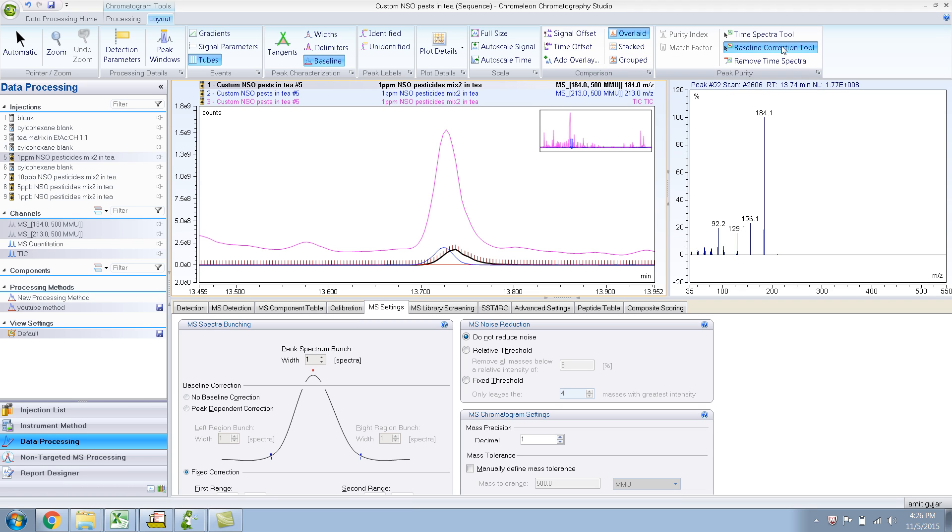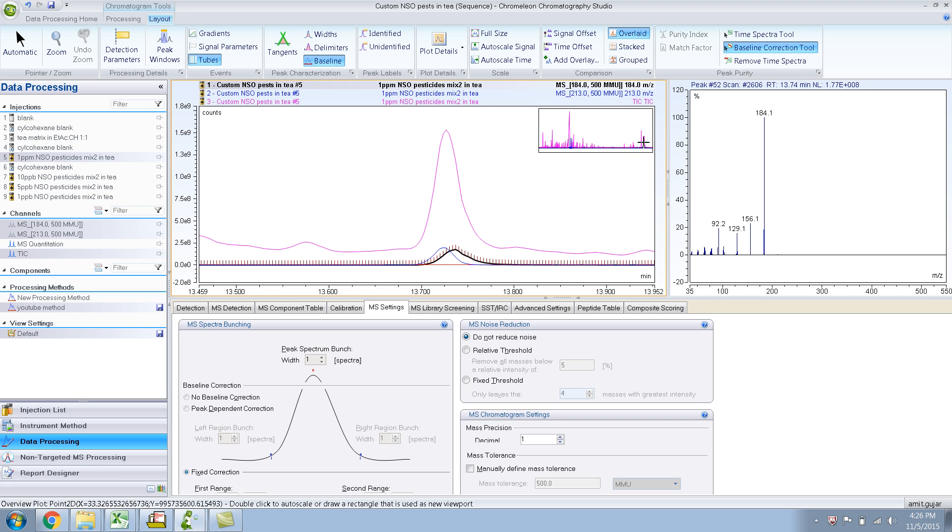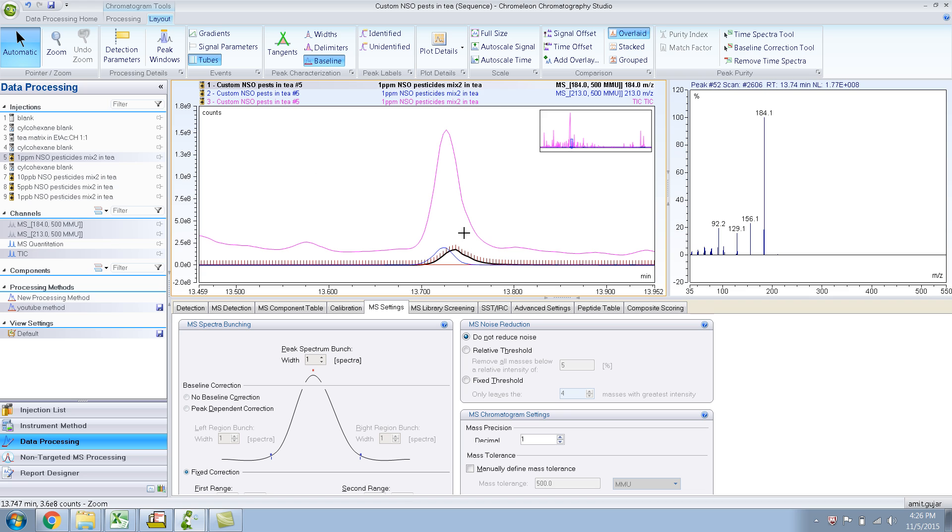To get out of this Baseline Correction tool, what you need to do is click on this arrow, the automatic arrow. And then you are out of it.